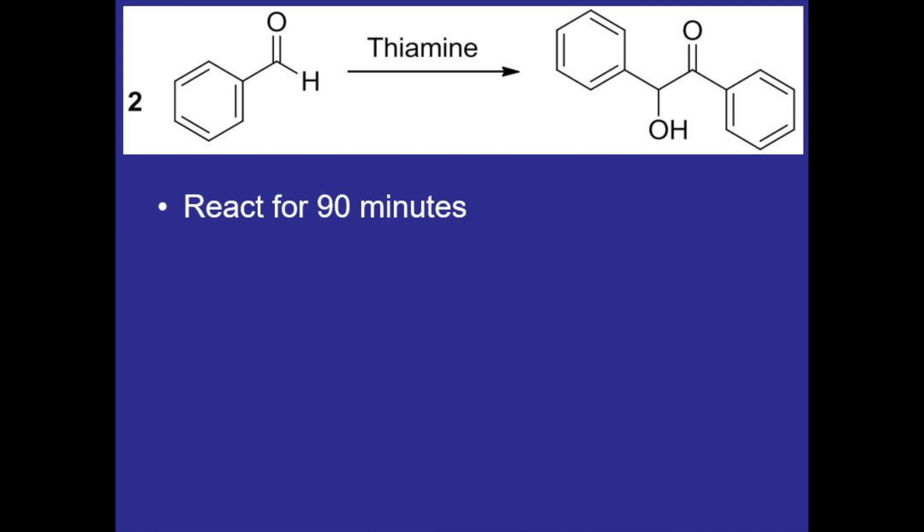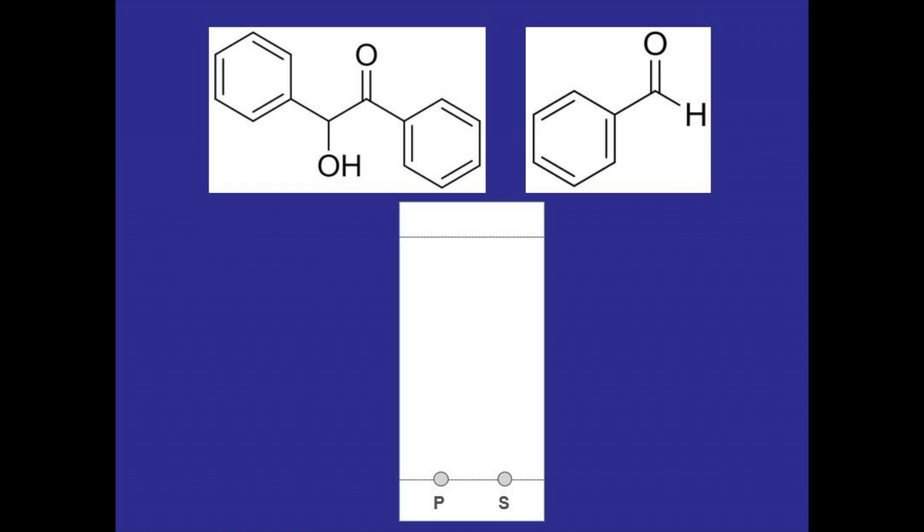We'll let that reaction go for about 90 minutes but about an hour in we'll test that the product is forming using TLC and what we're looking for is a big enough spot on the TLC plate for the benzoin product not the majority of it just being benzaldehyde.